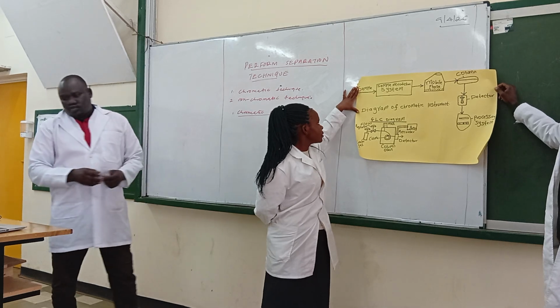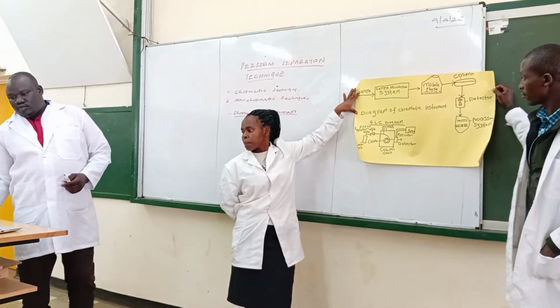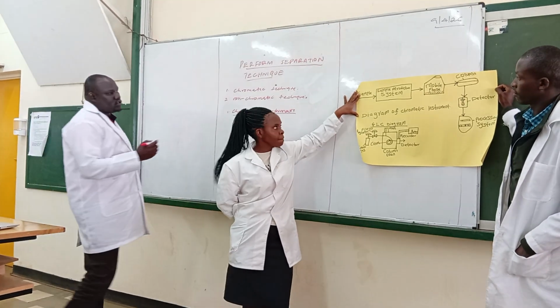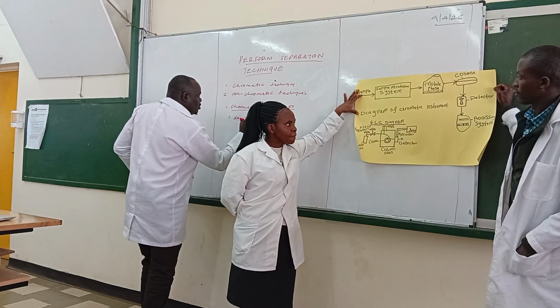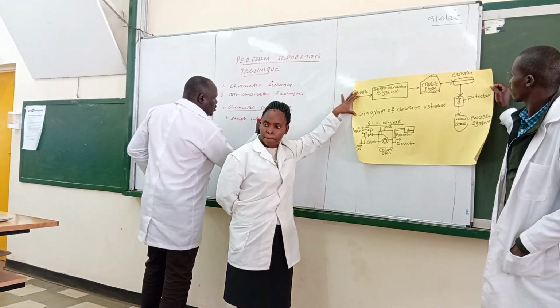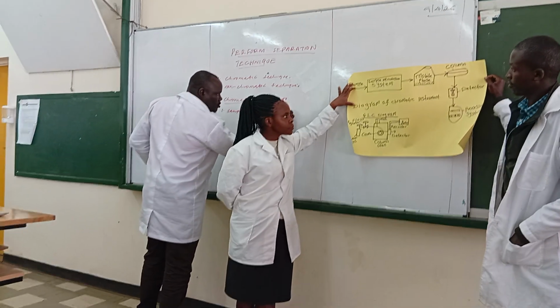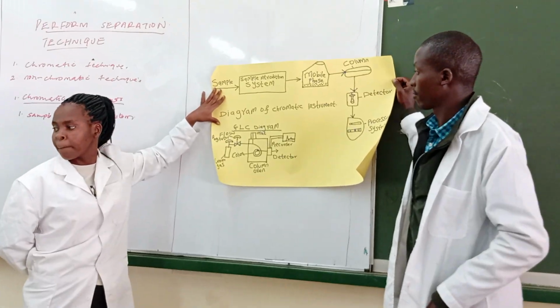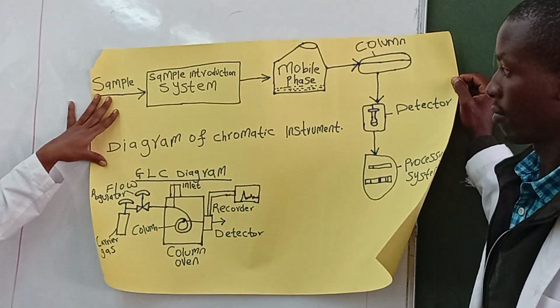When you are using chromatic instruments, the first one is the sample introduction system. The sample introduction system introduces small volumes of prepared samples.